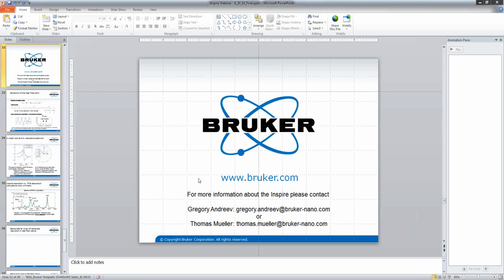Yes, such a layer would slightly change the results, but the layer should be there no matter what. Probably, if it's a water layer, it would exist on one layer of graphene and two layers of graphene, so it just adds a constant offset. What's important is what's underneath those layers.